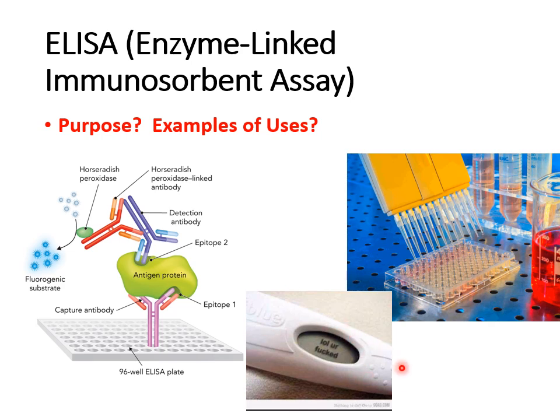So, circle, star, highlight that in your notes, because I like the fact that with a lot of the techniques that we talk about, like NMR and mass spec, these are things that students would not have necessarily encountered in their everyday life. And yet with ELISA, every time you walk through a Walgreens, a CVS, or maybe in your own personal experiences, you've all heard of and seen pregnancy tests. So I like to highlight that for you to think of ELISA. Also, COVID tests. There were a lot of ELISA-based COVID tests as well.